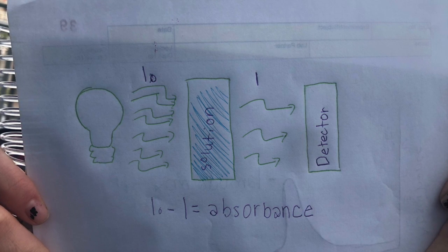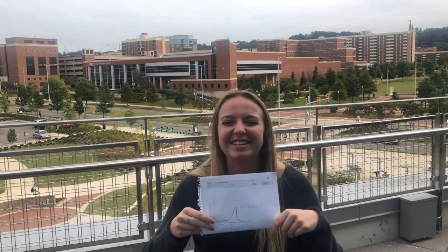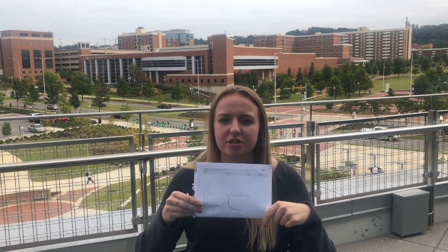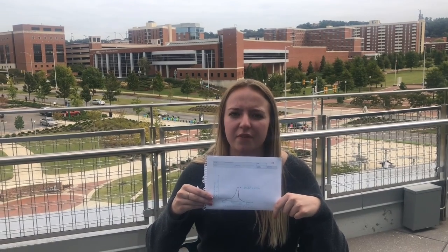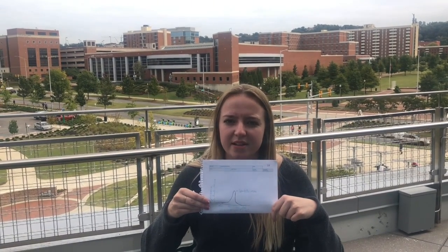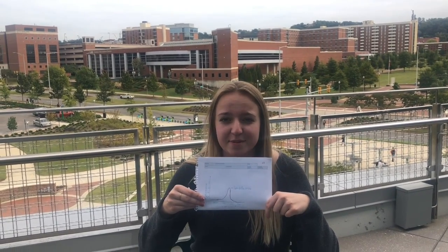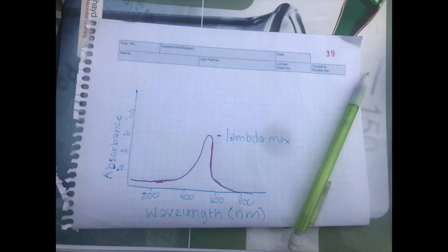As concentrations of your dilutions increase, so will the absorbance value. You need to determine the best wavelength of light to measure your dilutions at. Use a cuvette of stock solution to do this. Scan across all wavelengths and the spectrometer will show a graph of absorbance versus wavelength. The lambda max is the highest peak, where the absorbance of the substance is highest. So you use the lambda max wavelength to measure your dilutions' absorbances. The lambda max can also sometimes be used to figure out an unknown substance through comparison to known substances. Here's an example of the lambda max on the graph.